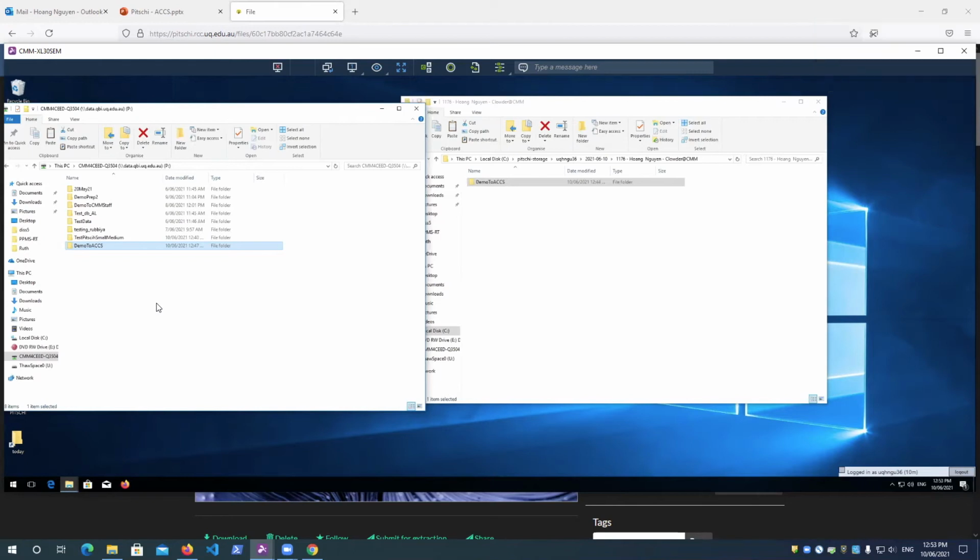We will be rolling out for most of CMM's instruments first. Those instruments generate small to medium amounts of data. With the large data generators, I think we would need to test very carefully to optimize the configurations, because all those configurations, like how often it syncs and where it syncs to, are configurable. We just need to tune it so that it works best for those instruments.